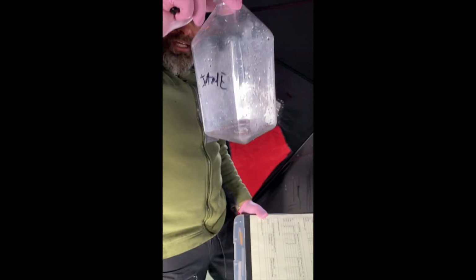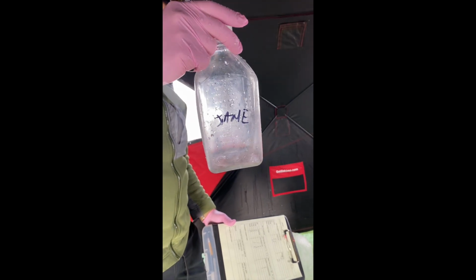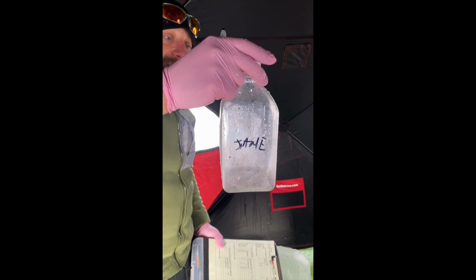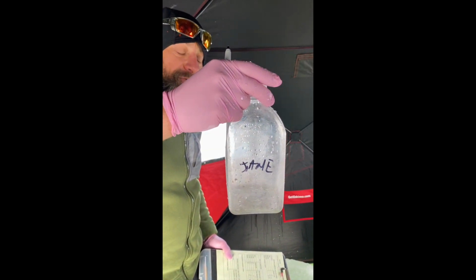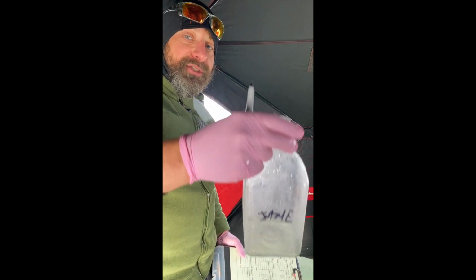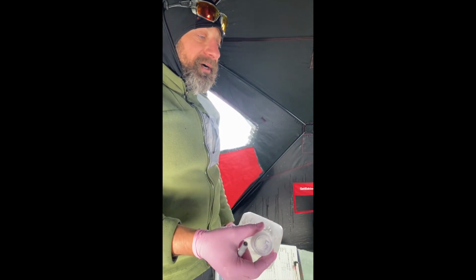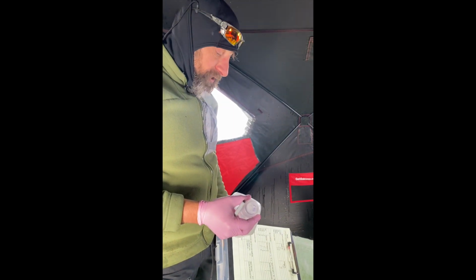The reason we collect it into these 1 liter bottles is to allow an opportunity for dead material or phytoplankton to sediment. And here, instead of collecting 1 or even 2 zooplankton tows, we're going to collect a few of them. How many you're going to have to collect will depend a lot on the zooplankton density in your lake, but the idea is to get a large sample for getting fatty acid content results.